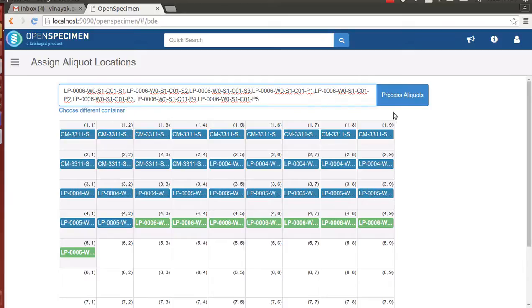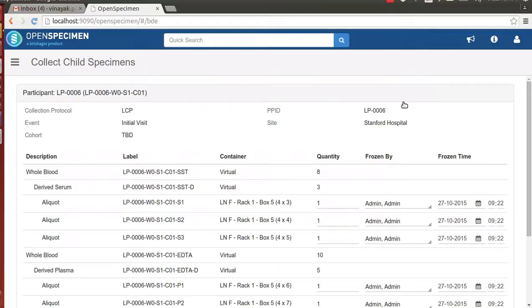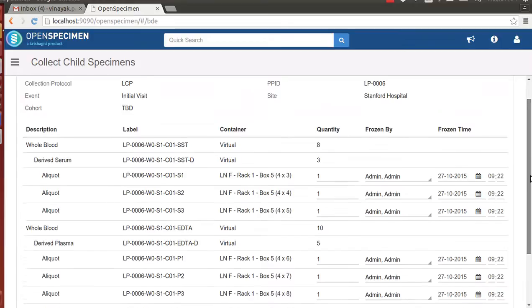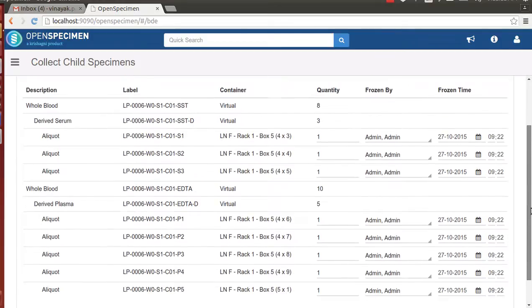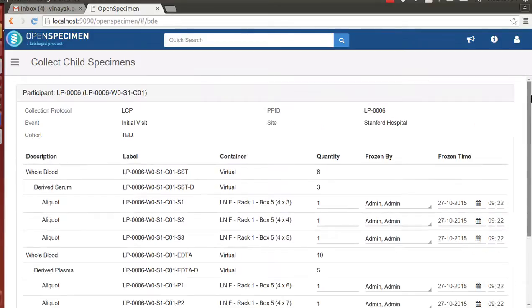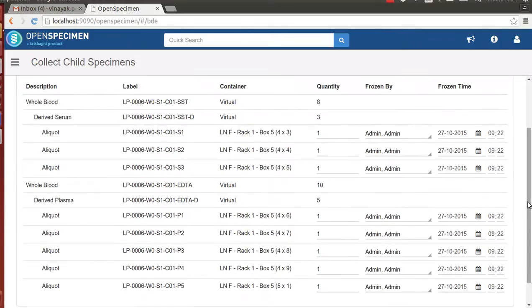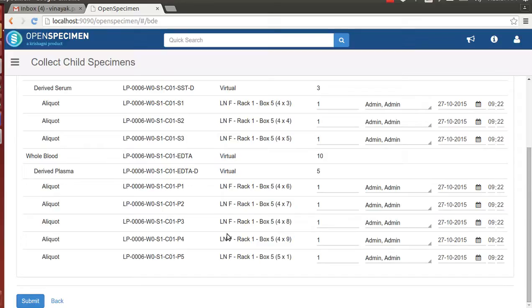The technician now can click on process aliquots to see the positions that will be assigned to each of the aliquots. The technician can review and submit to assign the position to create the aliquots and then assign the positions to each of those aliquots.